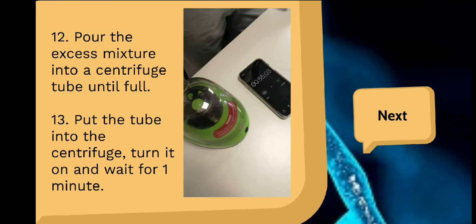Pour the excess mixture into a centrifuge tube until full. Put the tube into a centrifuge, turn it on, and wait for 1 minute.